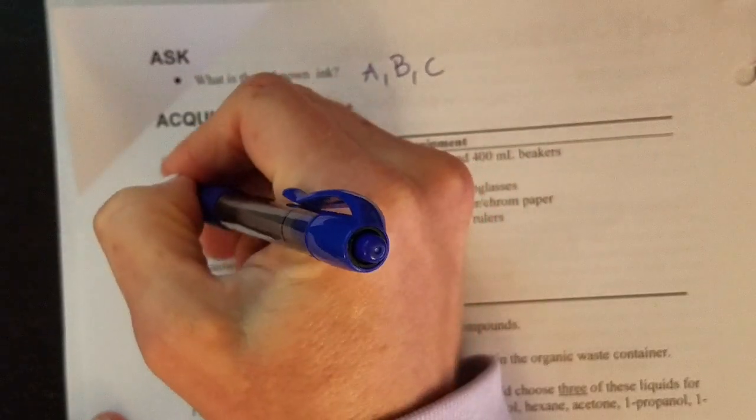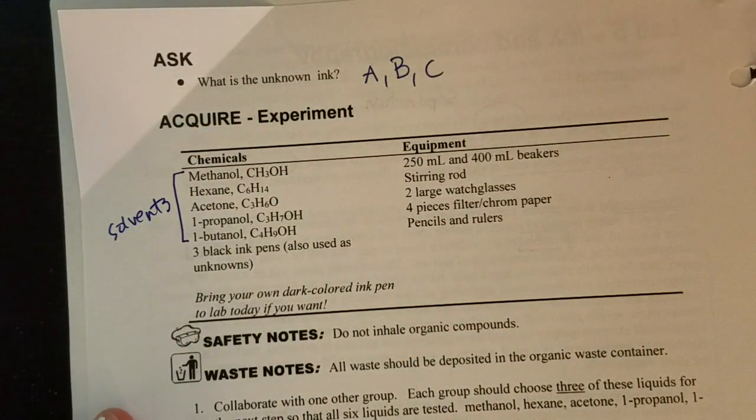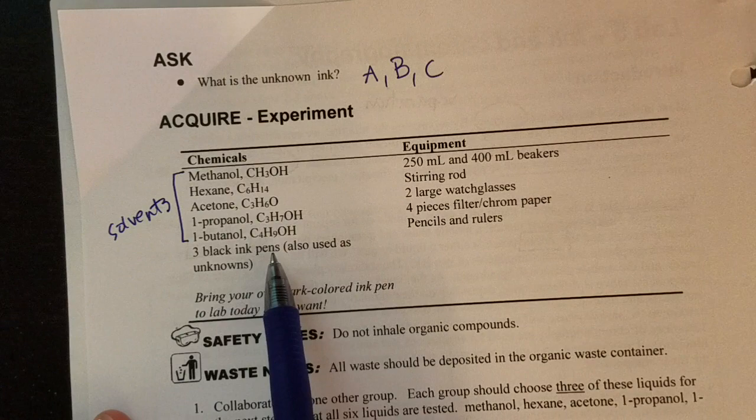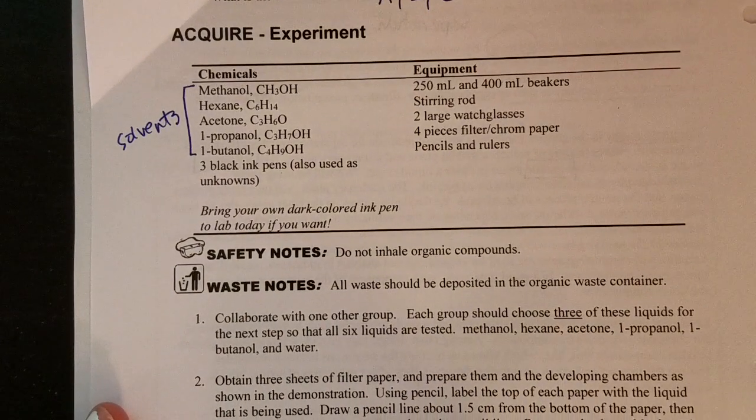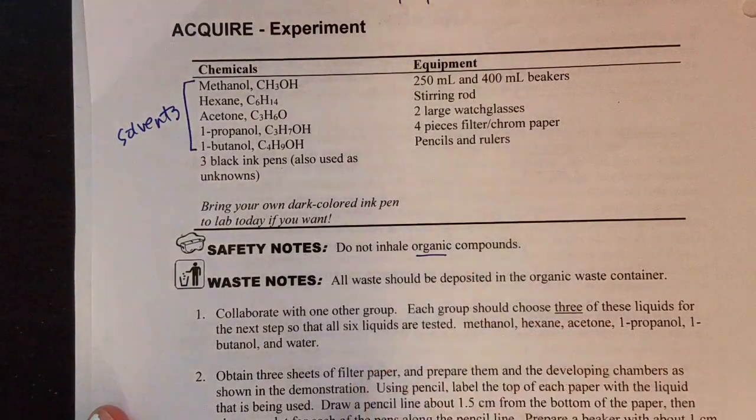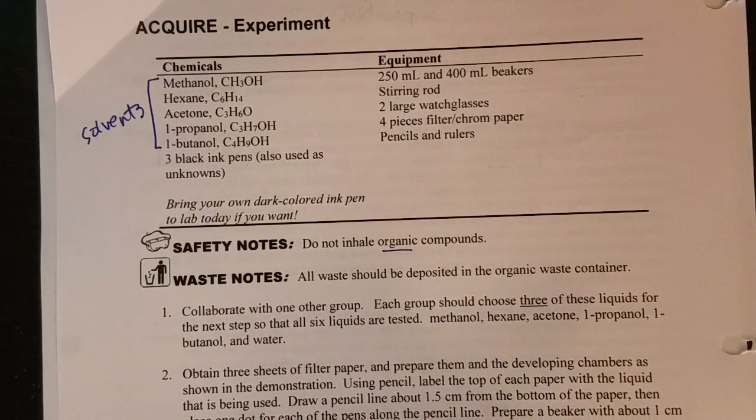Here's the chemicals that you're going to use. So these are going to be your solvents or your mobile phases here. We'll have three black ink pens, which you'll see in the video later. And then here's some of the other equipment that was collected for you. All of these compounds are organic compounds. So we would have a special waste container for them and we would be careful not to inhale them.